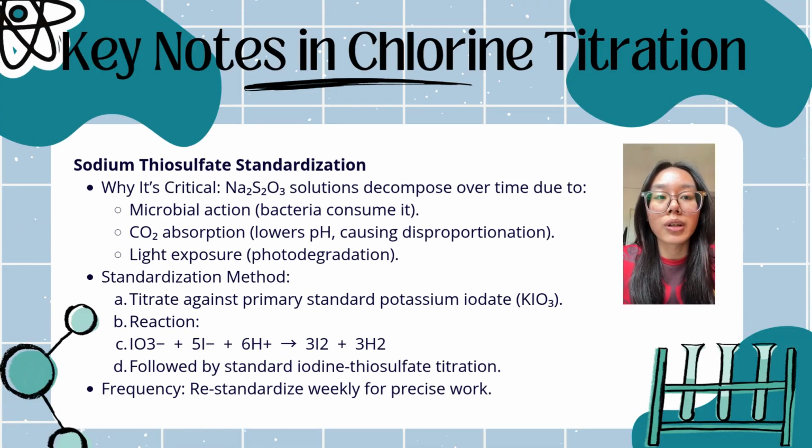Key notes in chlorine titration. Sodium thiosulfate standardization. Why is standardization critical? Sodium thiosulfate solutions decompose over time, which affects accuracy.